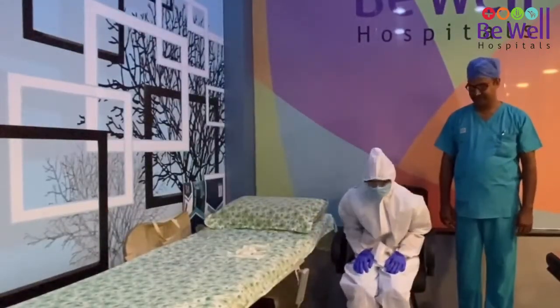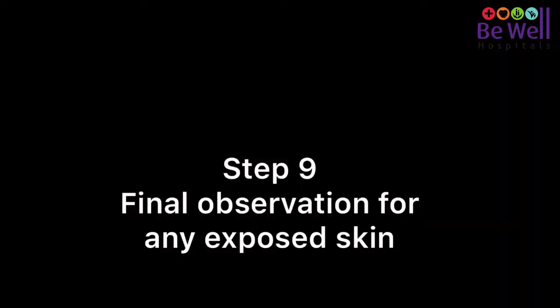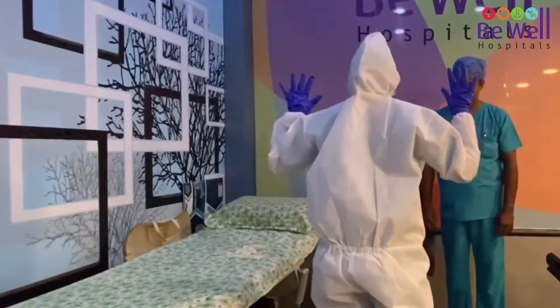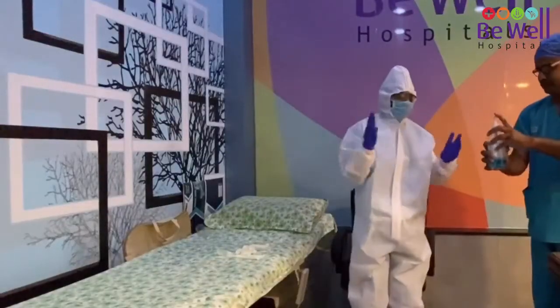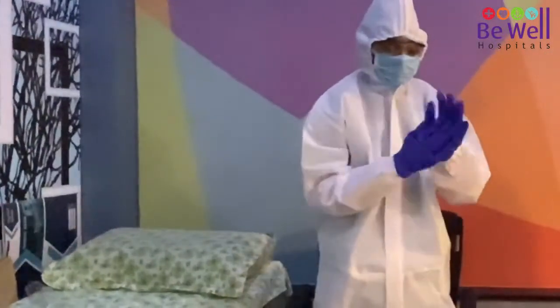After this, wear a second pair of gloves in a different color so that you can see if there is any tear. Step nine is the final observation — this is the job of the observer to make sure that the protection equipment is not torn in any place. Once this is done, perform hand hygiene and get to work.